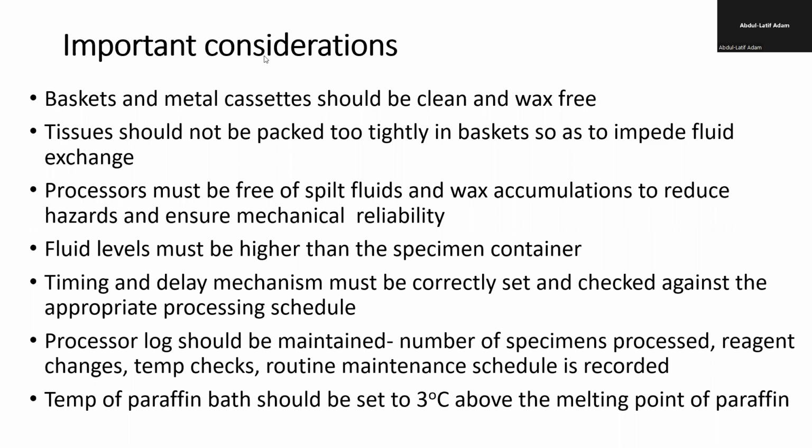And avoid accumulation of paraffin wax, especially on the floor. Molten wax spilling on the floor, like a candle, is slippery, so you can cause accidents. So you have to do that.